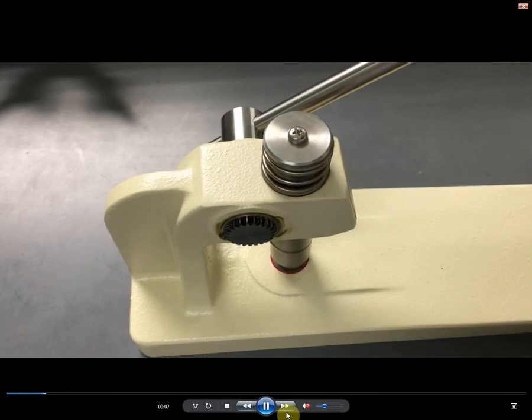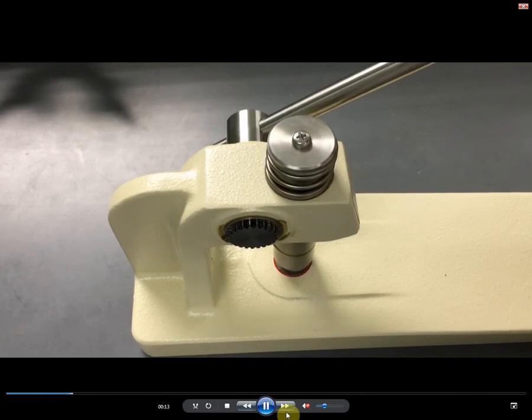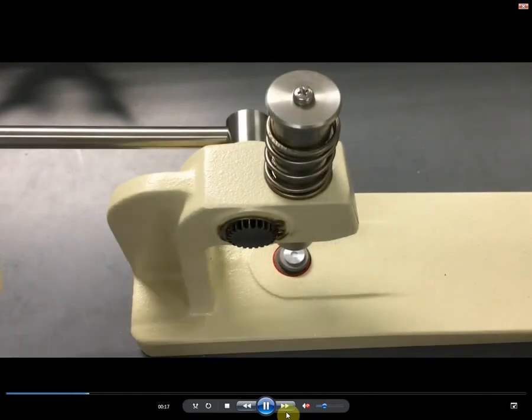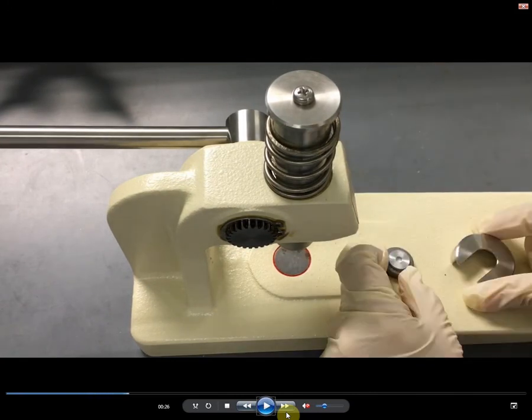Pull the handle and press the handle down. You need to apply sufficient strength for about 1 to 2 minutes in order for the disc to form properly. Then, use the pellet remover base and the pellet remover to remove the frame from the cylinders.